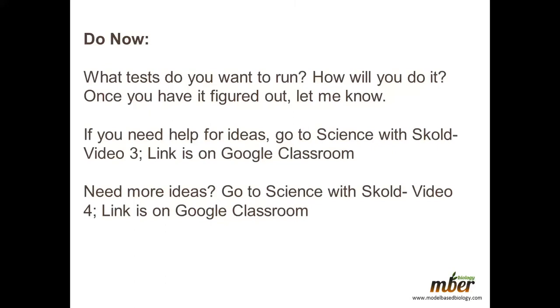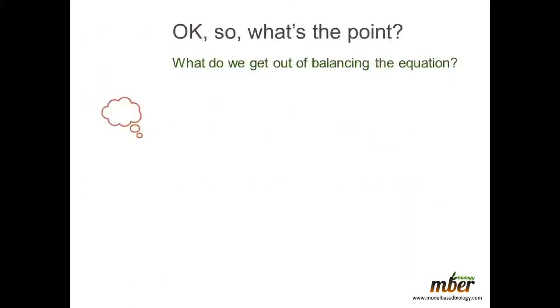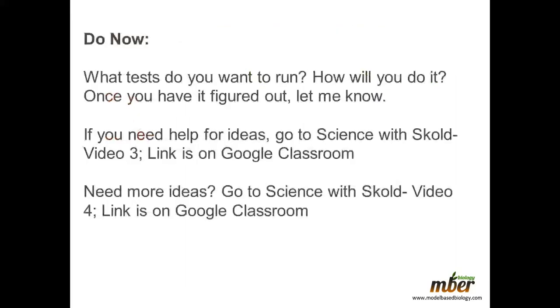So go to Science with Scold and check out his hintful videos. Now come back to me and figure out your tests. Sorry about that. Come back to me, figure out your tests, and then you're going to come back to this in about a half hour. So once you've got your whole plan, we're going to run some tests.